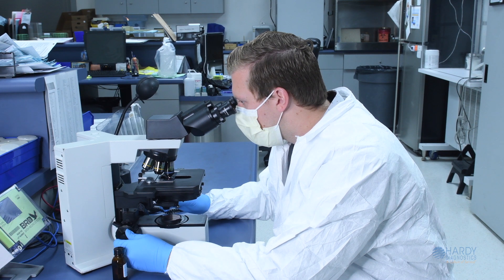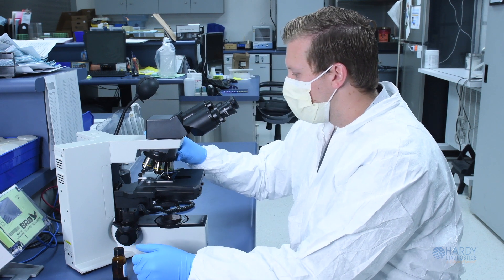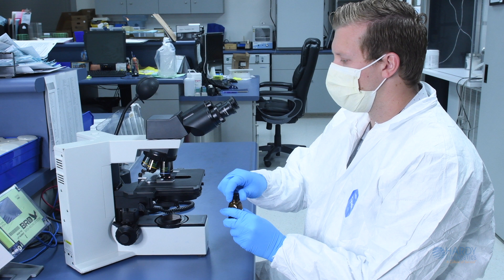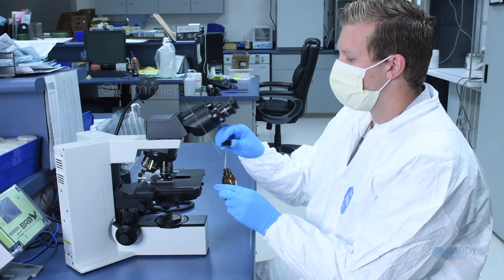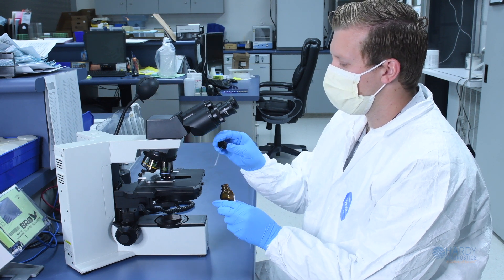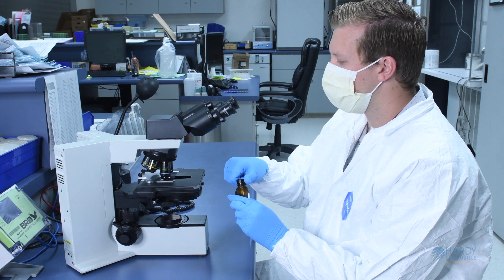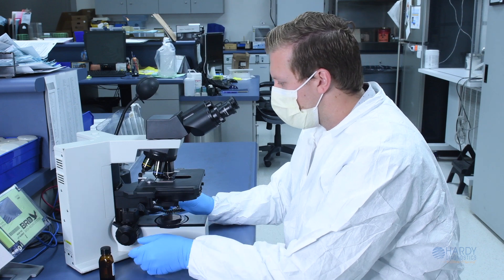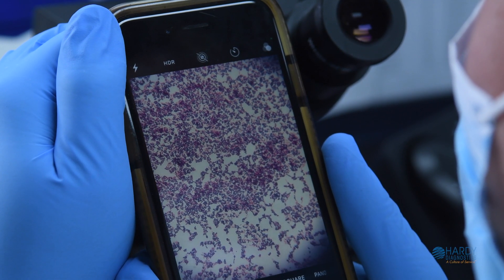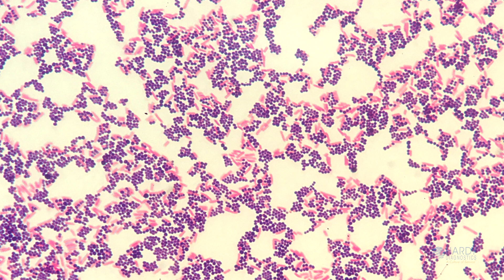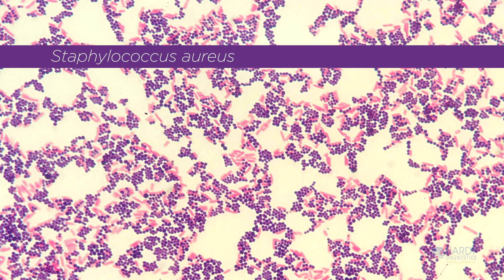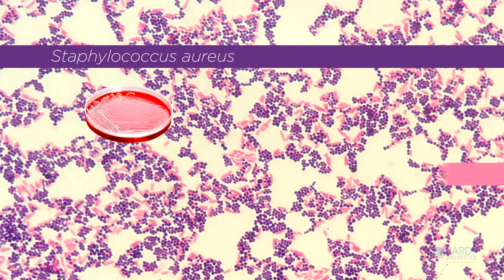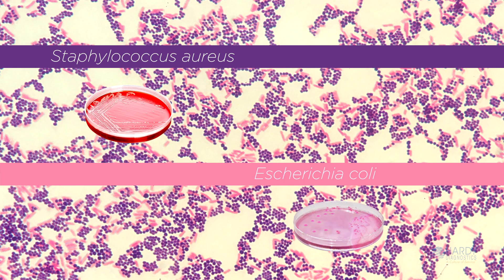The slide can now be viewed under the microscope. First focus on the image using the high dry objective lens marked 40x. Then, without removing the slide, switch to the high power oil immersion objective lens marked 100x, resulting in an overall magnification of 1000x. Here you see two organisms routinely used for quality inspection: the purple gram-positive cocci are Staph aureus, and the pink gram-negative rods are E. coli.